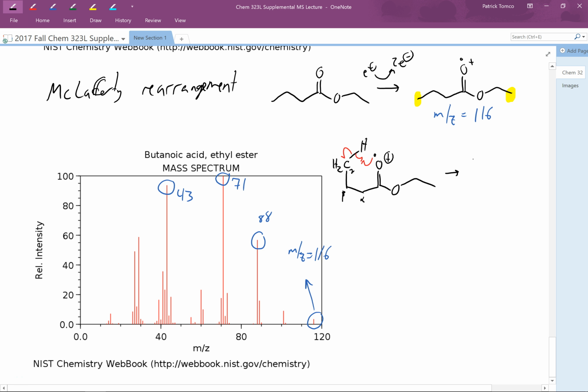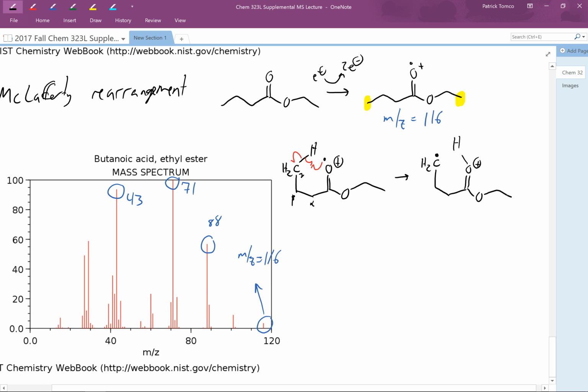So the reaction here leaves the following radical, and the oxygen now takes the positive charge. So now this molecule is in a position to rearrange the same way that we showed in the previous example. Only difference is that we're going to find a neutral loss. So this can form a double bond if the bond between the alpha and the beta carbon breaks, and it's going to pitch the electrons from one of those bonds into the alpha carbon.